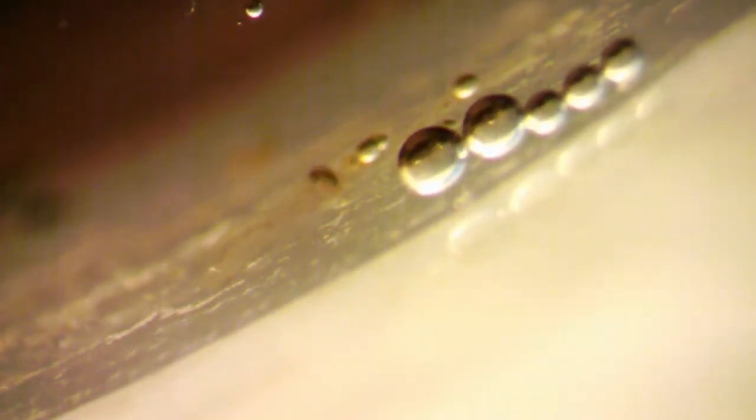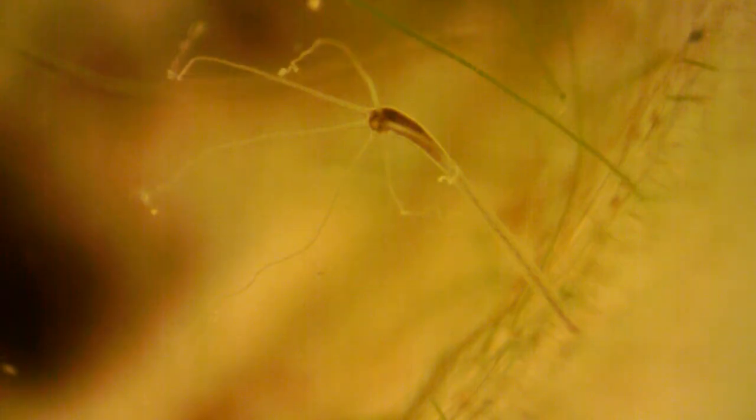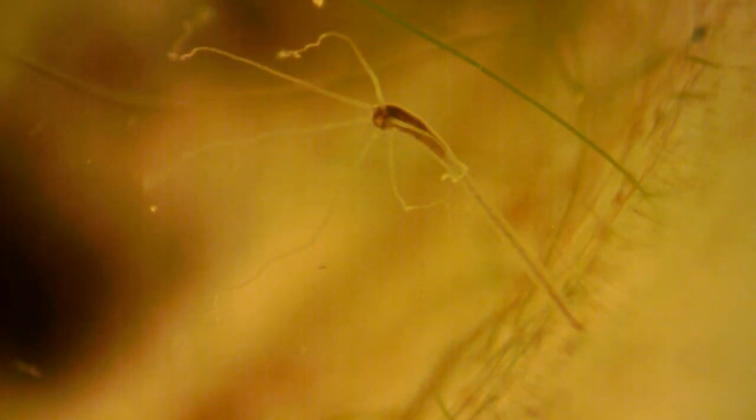Feast your eyes on the hydra. Related to sea anemones and jellyfish, this microanimal anchors to a surface and spreads out its tentacles, each one loaded with stinging cells. When prey hits a tentacle, it gets stung, stuck, and pulled toward the center mouth. The crazy thing is, hydras don't have a designated mouth. Every time they have to ingest prey or remove waste, they rip a new hole and then patch it again.